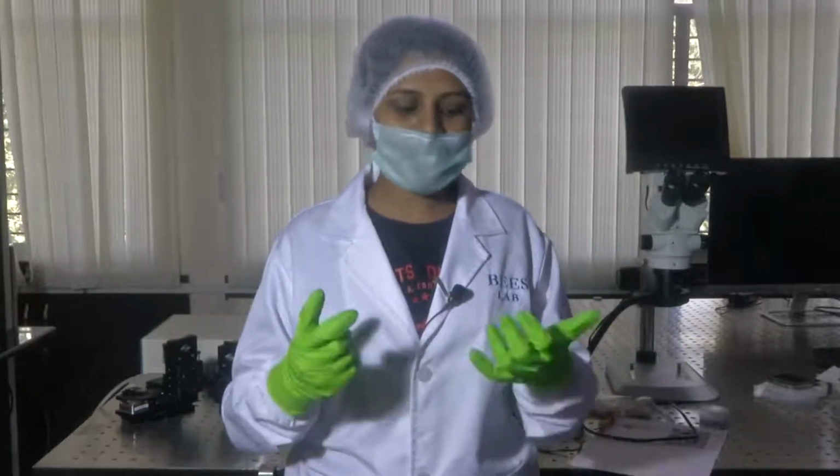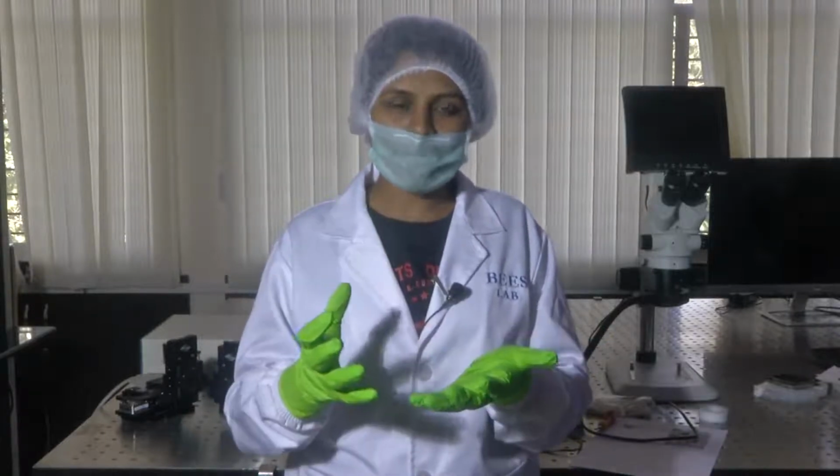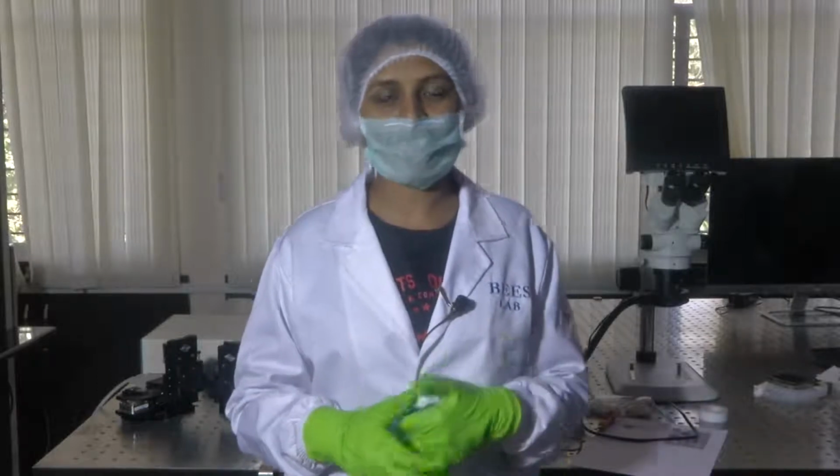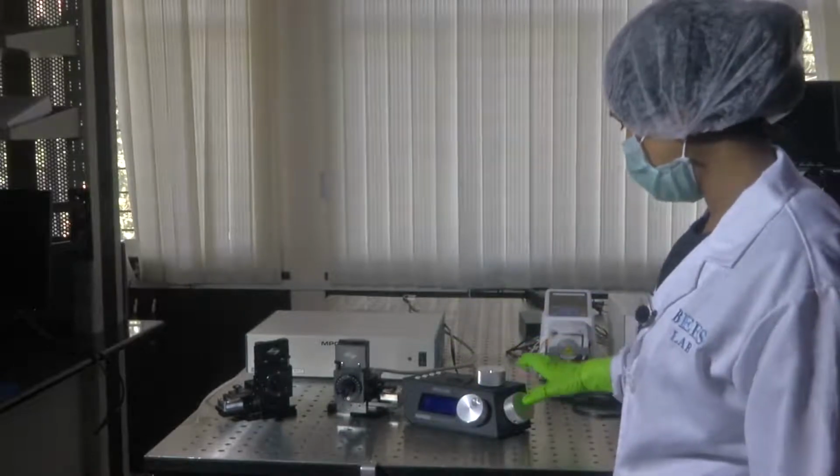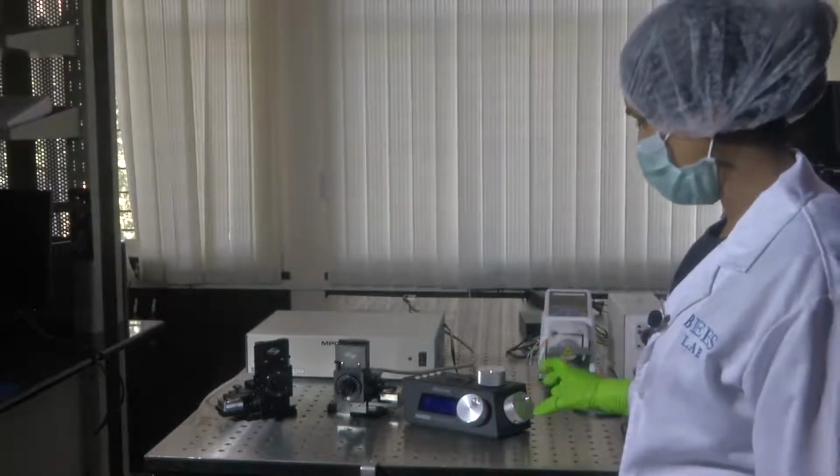For our purpose, let us see how we could use an indenter and a micromanipulator to understand the biomechanics of cells and tissues. So, the entire setup of the micromanipulator is here in our workstation.